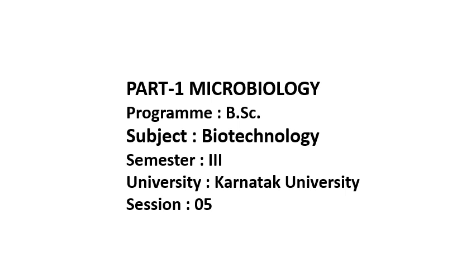Welcome back, students. Today I am going to share types of stains and techniques used in simple staining. Let's get started.